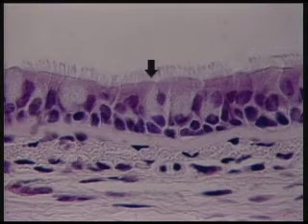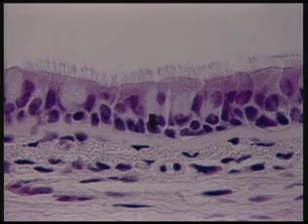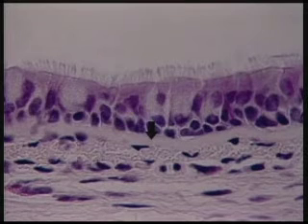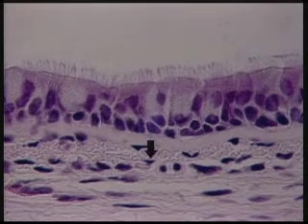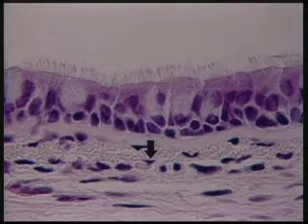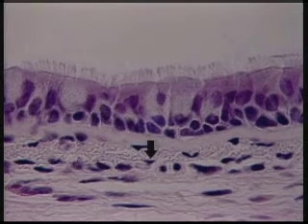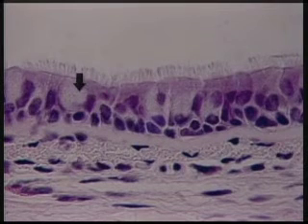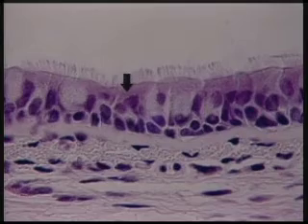In this case, the epithelium extends from here to here. It sits on a well-developed basement membrane here and is supported by some loose connective tissue here called the lamina propria. There are several different kinds of cells lined up next to one another in this ciliated pseudostratified columnar epithelium, such as mucus-secreting goblet cells here and ciliated cells here.